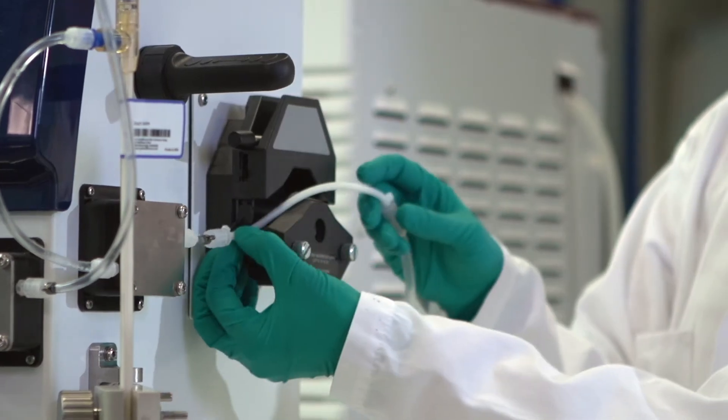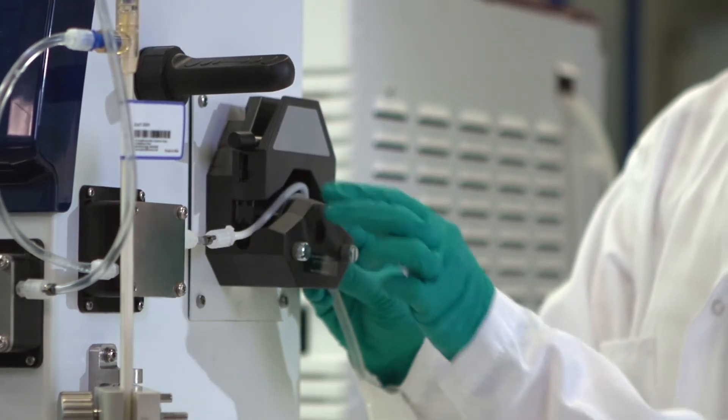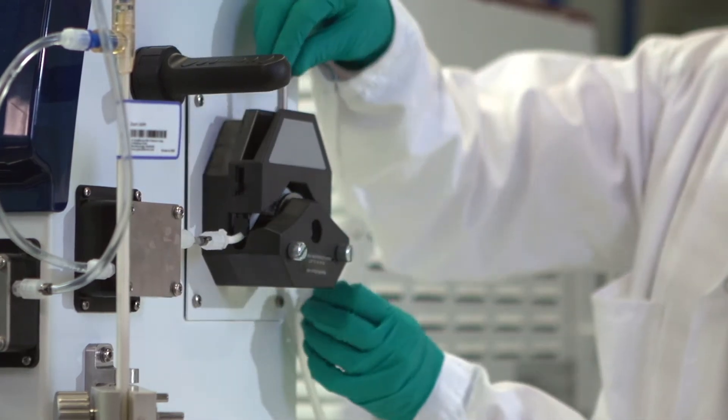To enable a stable flow and to prevent early fouling of the filter, a permeate control pump can be used.